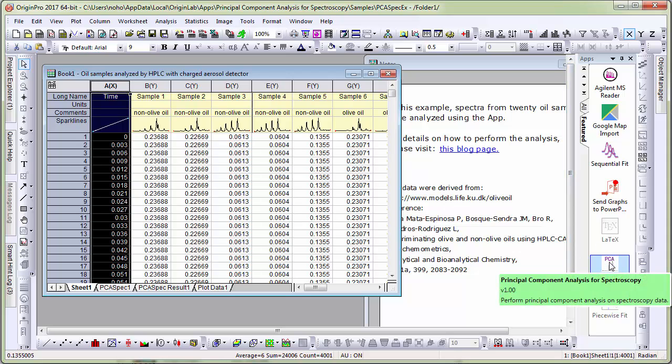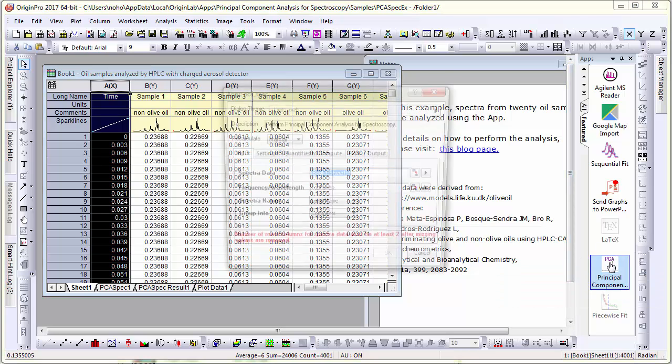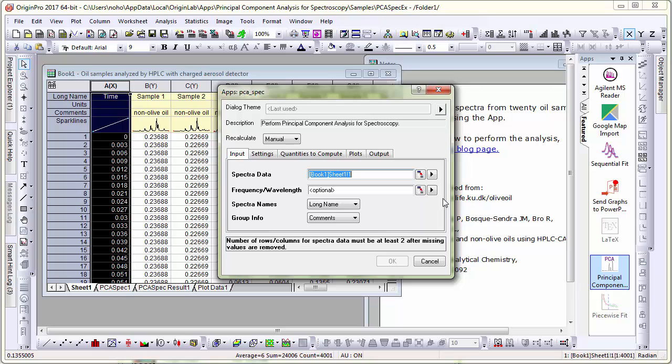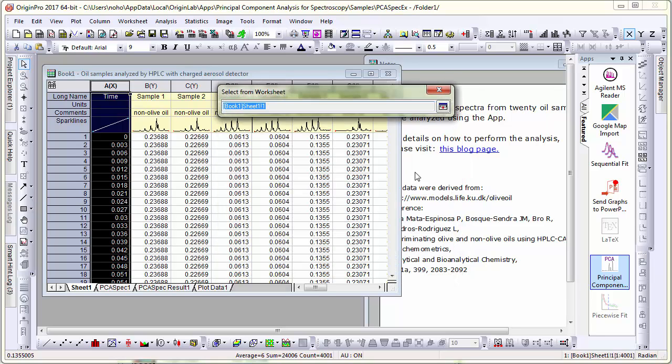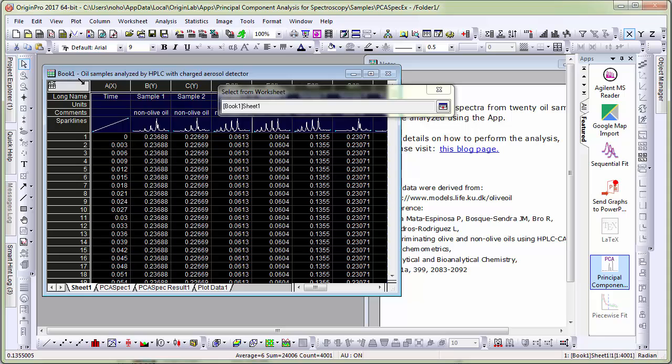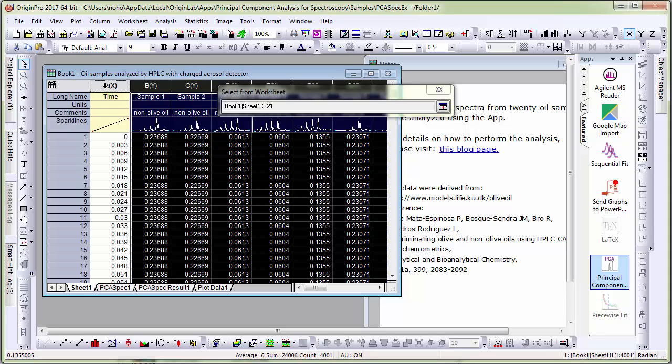Let me launch the dialog and first I need to select the spectra. I click the Hunt button, select the entire sheet, hold Ctrl key and leave out the first column, thereby selecting all the other columns as my spectral data.